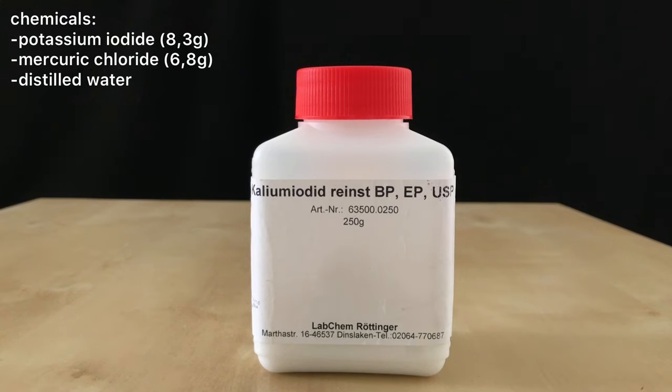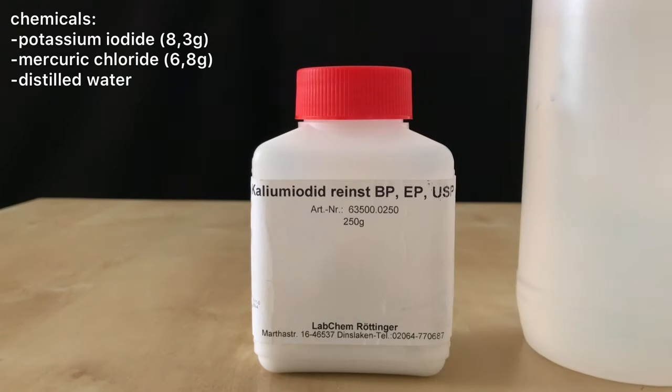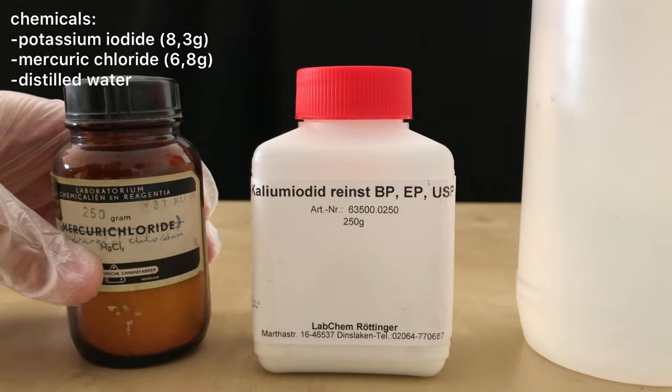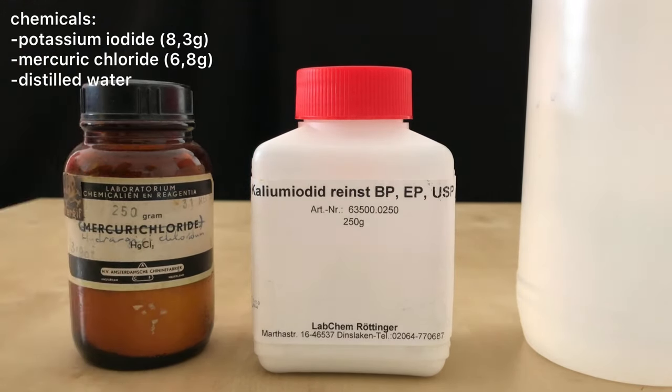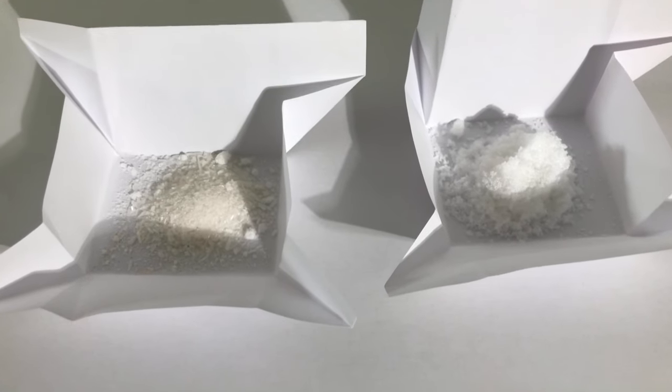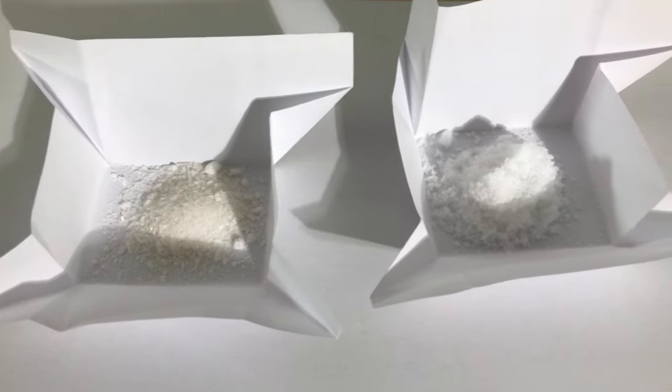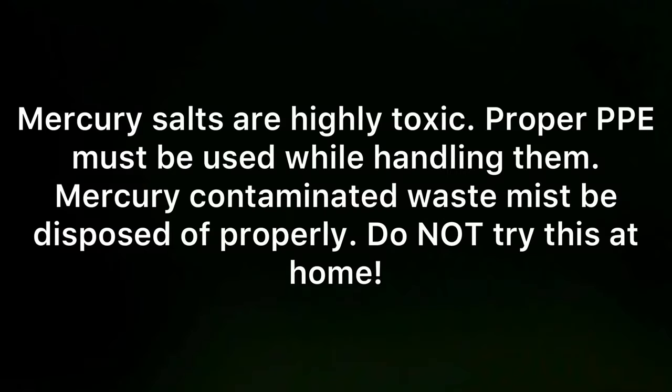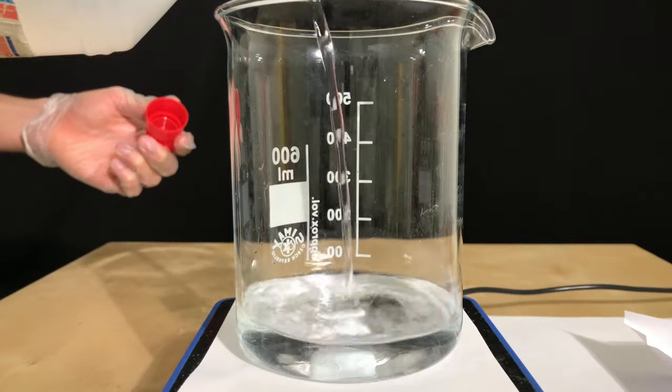For this experiment only three chemicals are needed: 8.3 grams of potassium iodide, 6.8 grams of mercury chloride which represents a small excess, and distilled water to act as a solvent. Mercury-2-chloride which you can see on the left is a highly toxic mercury salt and potassium iodide is also a white powder, but it's not as toxic as mercury chloride.